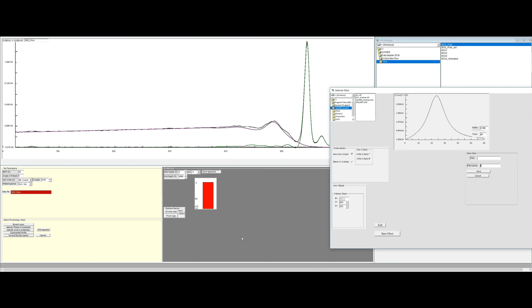But this shows how you can find a reasonable cross section for samples where you don't have a cross section available. Usually you would not need to use this because the cross sections you have here are usually sufficient. But it's nice to have in some cases.